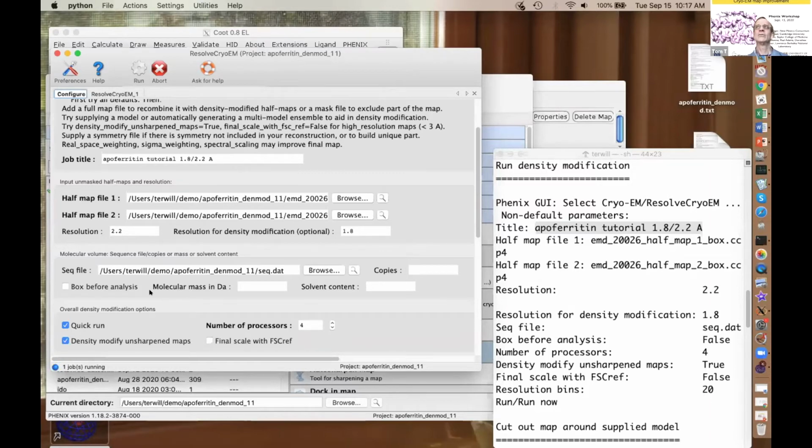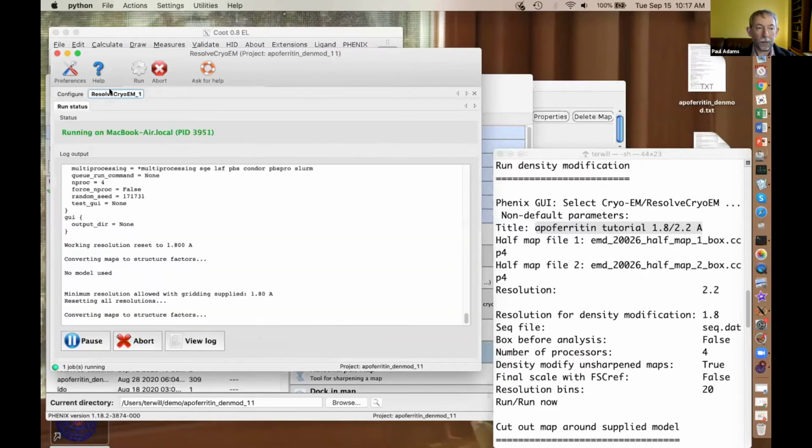The perfect thing would be to be able to take into consideration that the noise falls off with distance and all that. We don't have that, so boxing is a very convenient way to make it relatively uniform outside the molecule. So that automated option is suggested rather than doing it manually somehow beforehand.